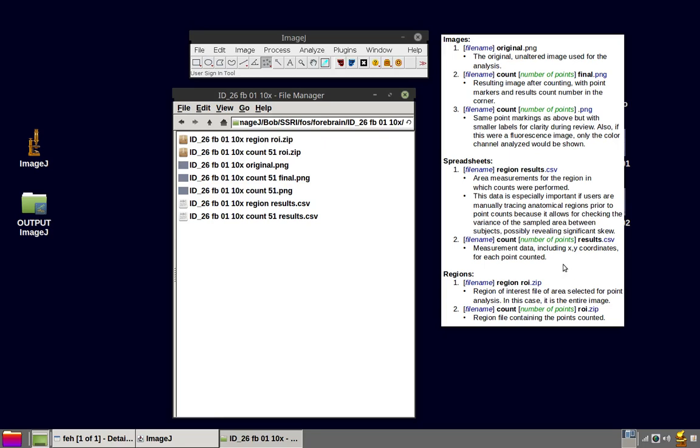Two spreadsheets are generated. One called region results. In this case, it would be the filename with the suffix region results. And this spreadsheet has the area measurements for the region in which the counts were performed. Now, you may recall, we didn't actually select the region. We just used the entirety of the image. But this data is especially important if users are manually tracing anatomical regions prior to point counts, because it allows for checking the variance of the sampled area between subjects and that's possibly revealing significant skew.